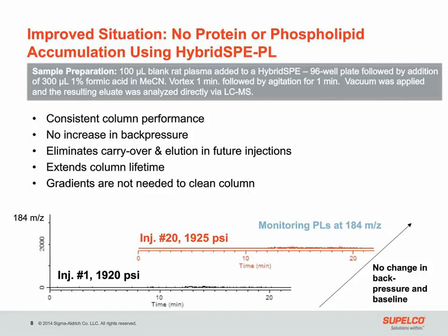So how can we fix this? Following a standard sample prep using the hybrid SPE phospholipid 96-well plate, you can see there is no increase in back pressure and no carryover of phospholipids, eliminating the need for the cleaning gradient at the end of each run. The initial back pressure is 1,920 PSI, and it only increases to 1,925 PSI after 20 injections. There is little, if any, increase in the background baseline.